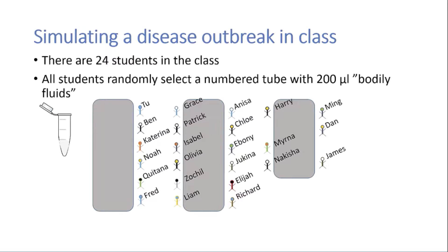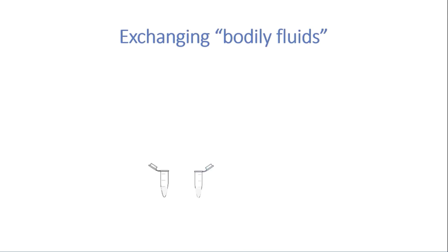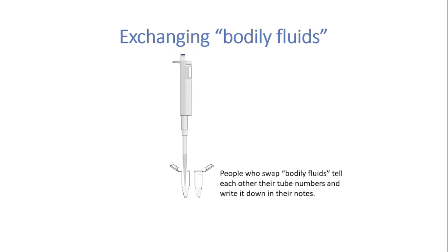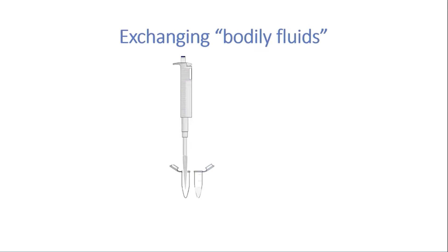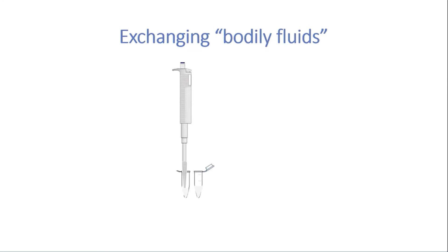Students will then exchange bodily fluids with each other by mixing the fluid in the tubes. Two students will meet up. One student will use a 200 microliter pipette to transfer all their bodily fluids into their partner's tube. The fluids are mixed by pipetting up and down a few times, and then 200 microliters is transferred back to the original student's tube. The two tubes are held up side by side to confirm approximately equal volumes, and then everybody returns to their seat.